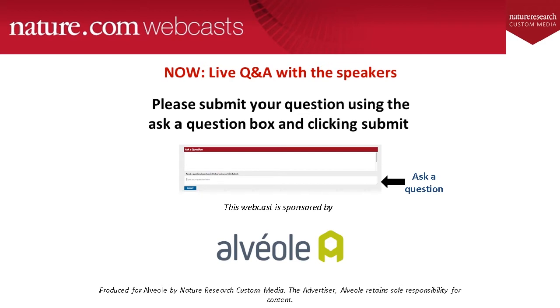Yes, this is an important thing to keep in mind when you're working with these micropatterned EM grids. With the chemistry that I've presented here and that we've also published in our paper, you definitely want to plate cells within about 48 hours. We know that the passivation, so the PEG layer, should be stable for between 48 and 72 hours.